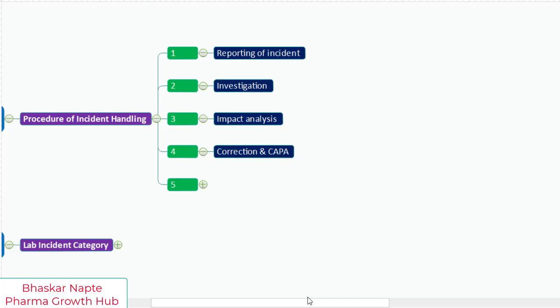How are you going to assure that? What is the system that you are going to place so that the wrong column will never get used in all future analyses? That is called the corrective action.